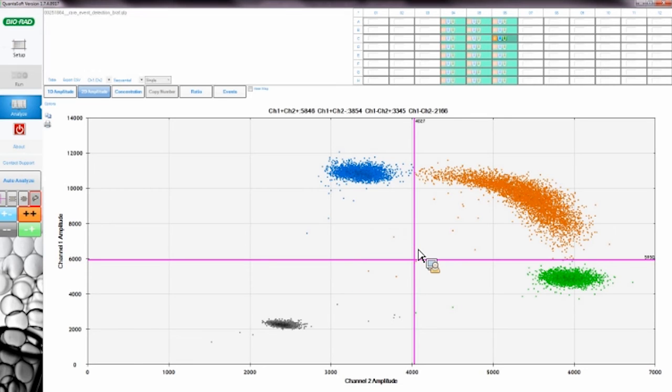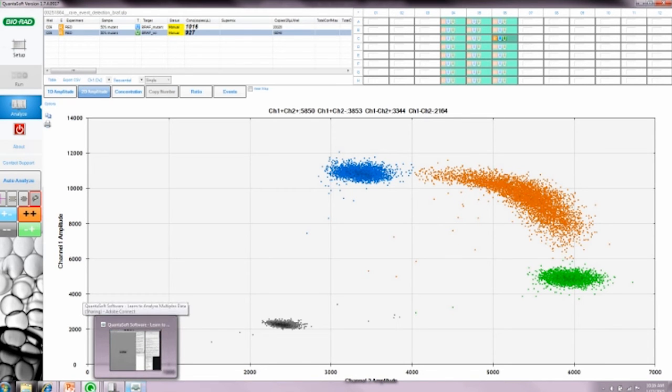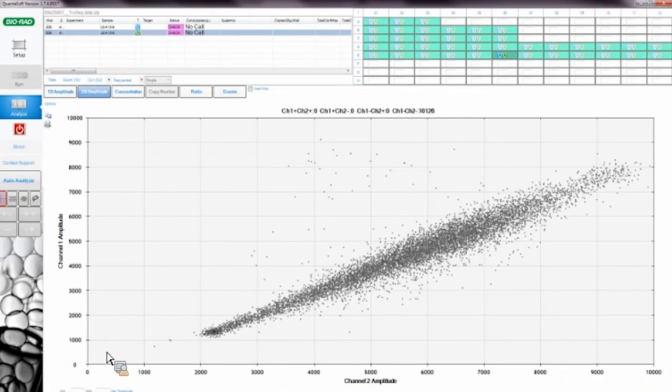The last example I'd like to cover today is data from our Illumina TruSeq library quantification kit. Here, our droplets of interest are moving along the diagonal and contain inserts of varying sizes within the library. Fragments will go from larger to smaller as we move away from the negative population. The droplets at the highest point are the adapter-adapter ligations and do not contain an insert. Those that appear above and below are the rare species that have 3 or more adapters ligated into an insert.